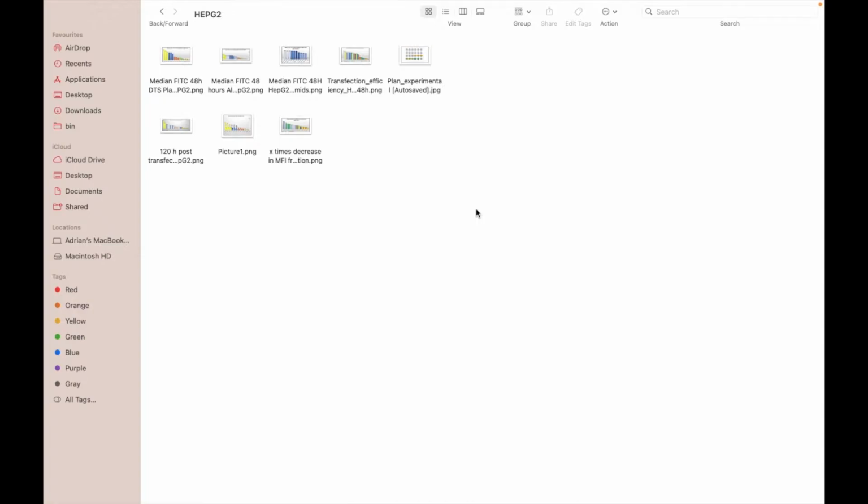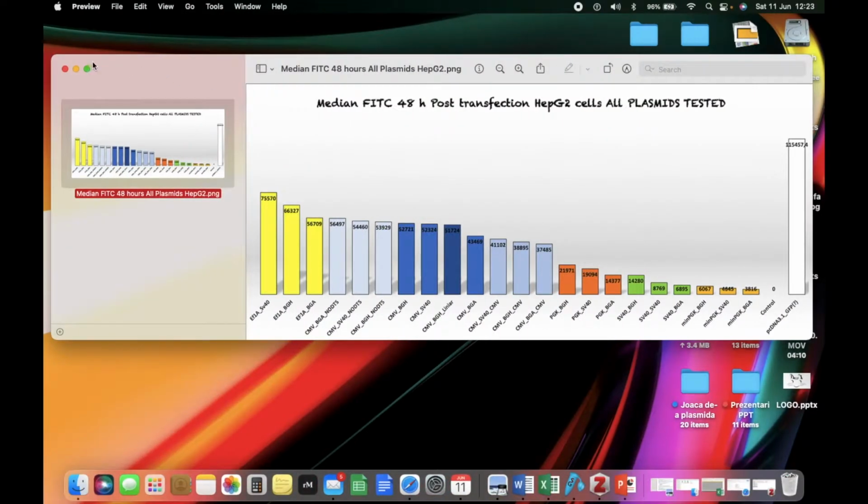to acquire, just so I know in the future what exactly is the best promoter and terminator combination to use. Which one provides the best expression? So I'm trying to optimize my vector for the best possible expression. After I transfected the cells, I measured them using flow cytometry, as I said, at 48 hours post-transfection, and I got these results right here.